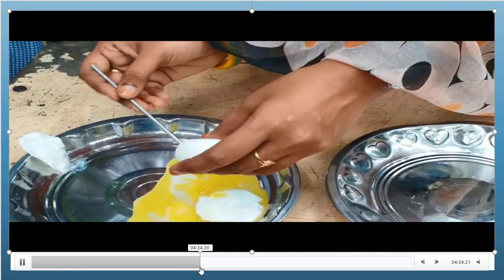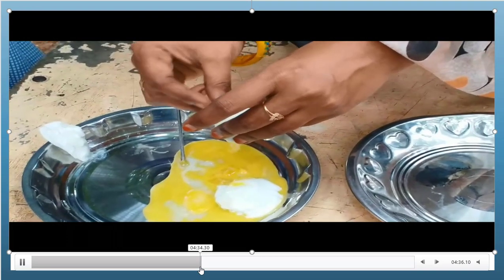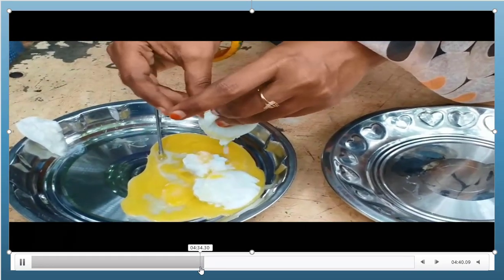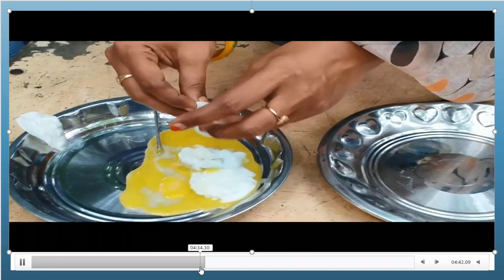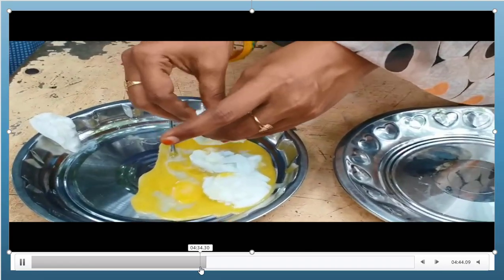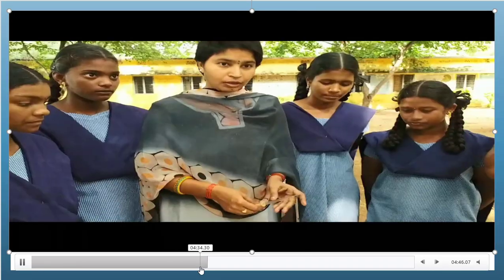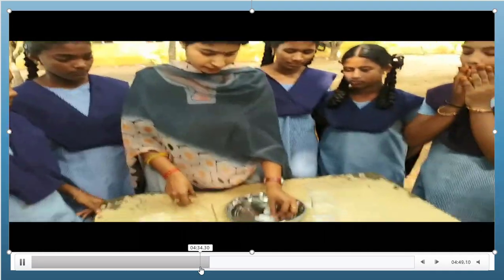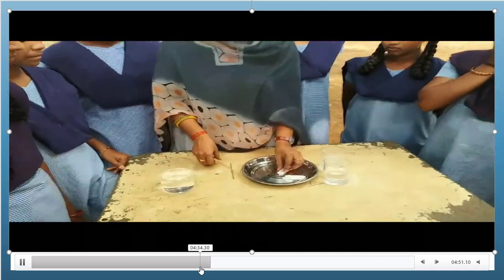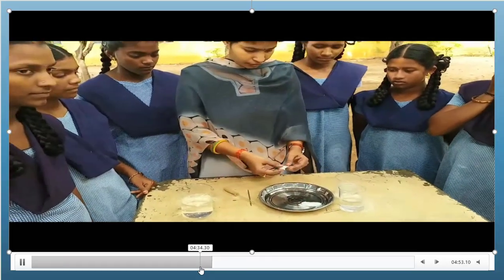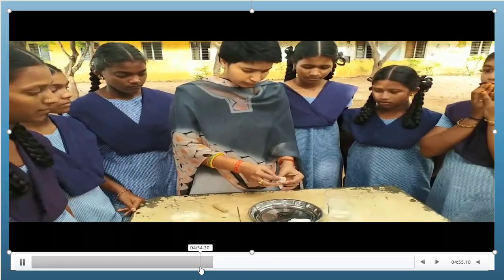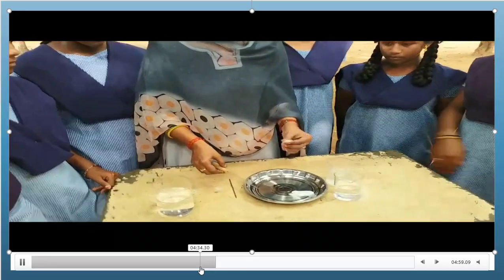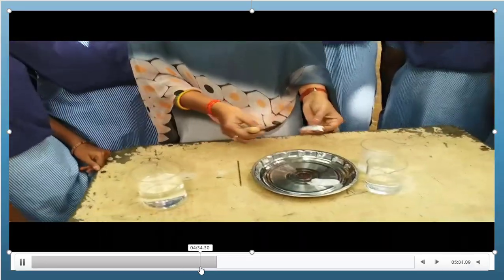The inside part is removed. We wash both egg membranes with water. Now they are ready to do the osmosis experiment — they have been washed properly.